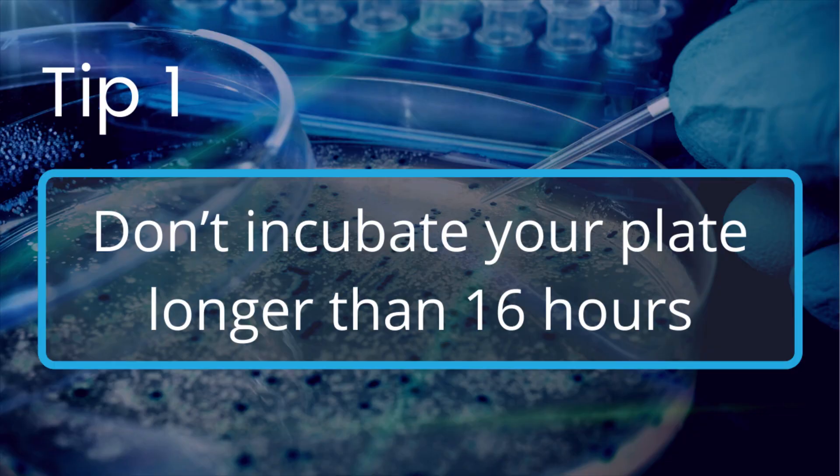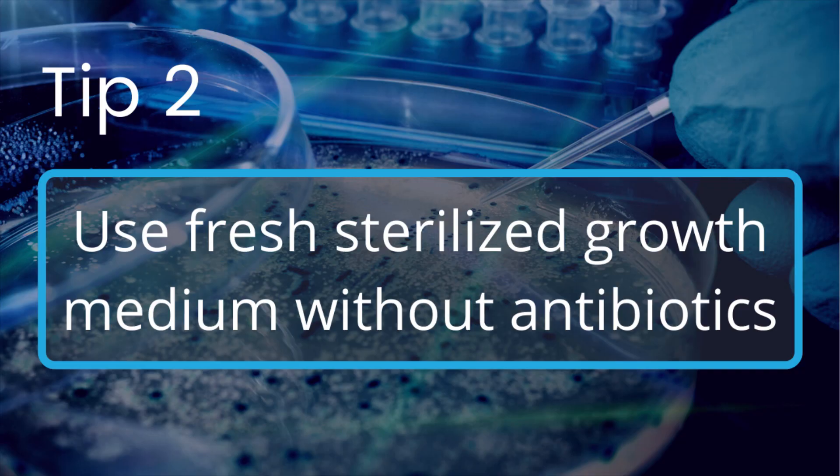But don't worry because we do have some tips on how to avoid satellite colonies. First tip is just making sure you don't incubate your plate longer than 16 hours — this is probably the most important tip when it comes to avoiding satellite colonies. Our second tip is just to use fresh sterilized growth medium without antibiotics and then add your antibiotic to the plate before growing your colonies.